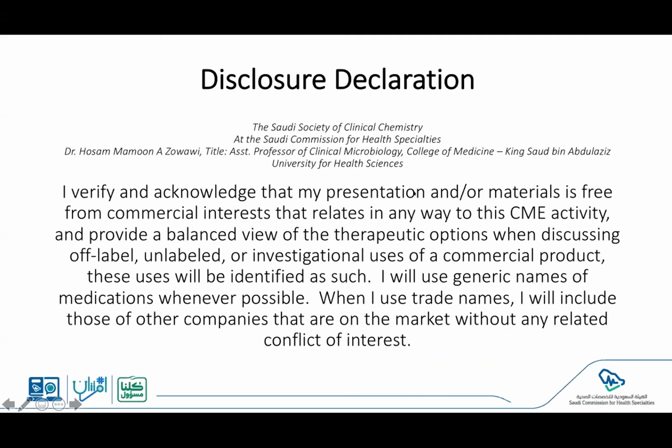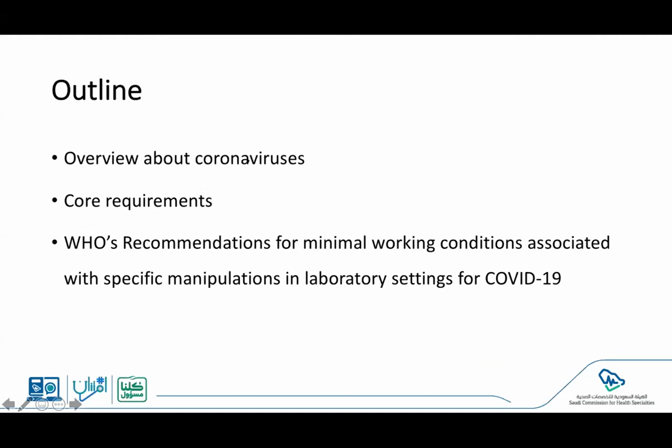The presentation today will be divided into three different components. We'll be briefly giving an overview about coronaviruses. The second is we'll go through the core requirements for most of the clinical microbiology laboratories, or laboratories that are manipulating SARS-CoV-2, the virus that's causing COVID-19. And we will finalize the presentation by going through different recommendations for minimal working conditions that are needed for the manipulation in the laboratory of the virus that is causing COVID-19.